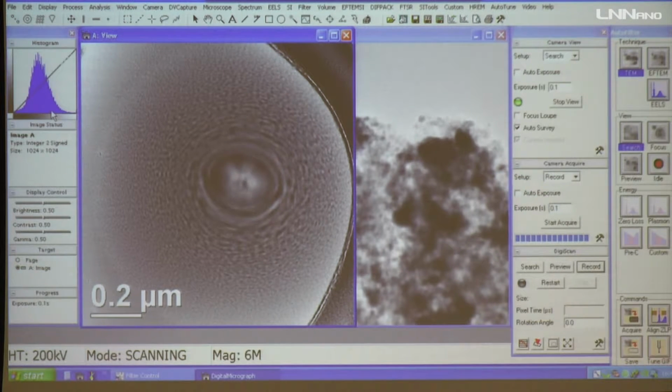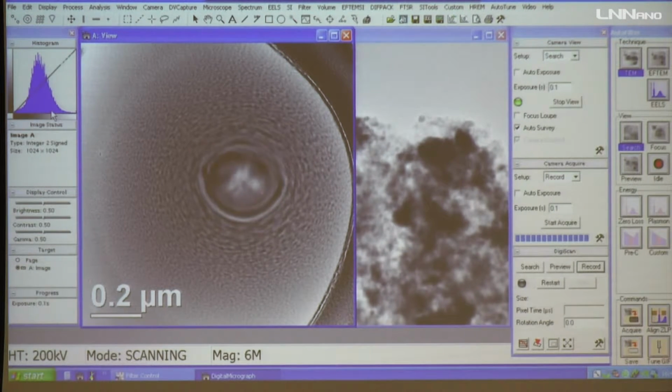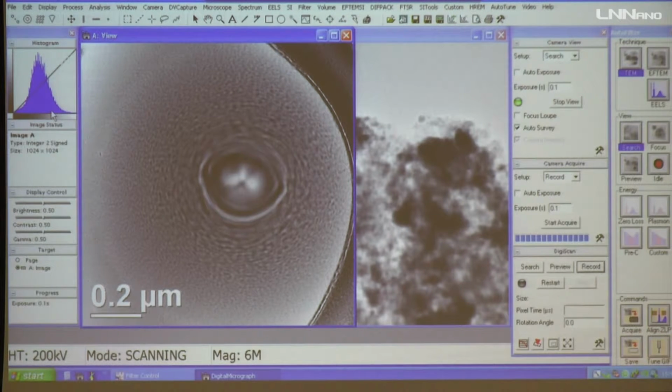Because you are convergent, you are focusing the beam on your sample, and then you have the best possible focus on the material. What we need to do for alignment is to try to find this best situation to position our condenser aperture.